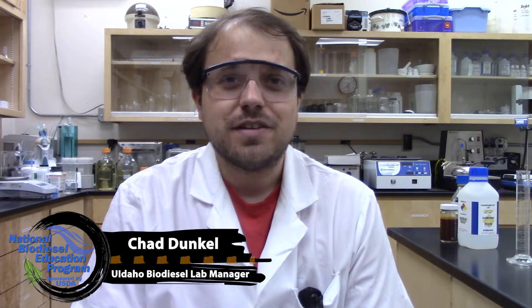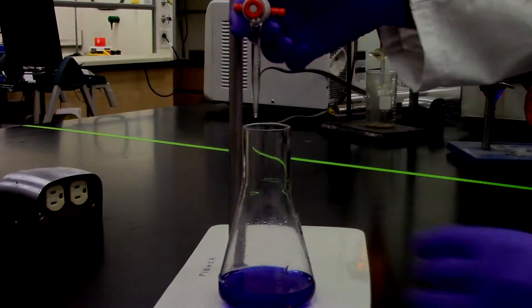Hi, this is Chad Dunkel at the University of Idaho's biodiesel lab. We're here today filming a video on how to do a soap titration.